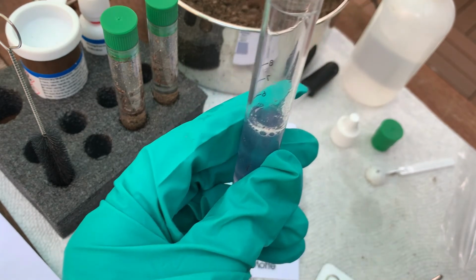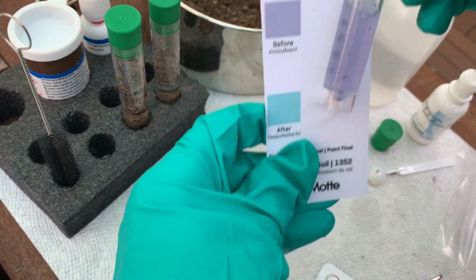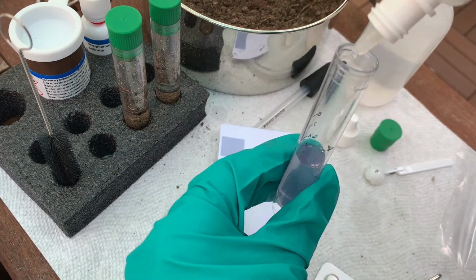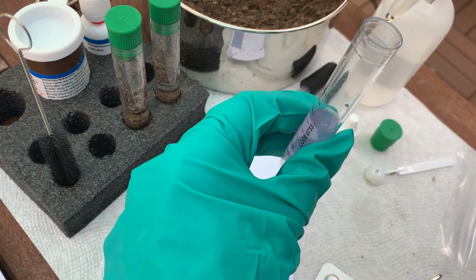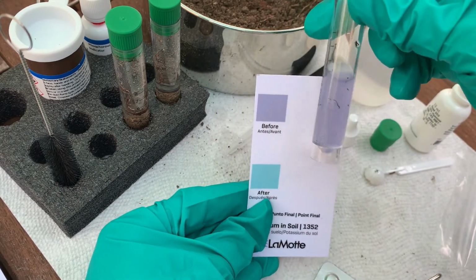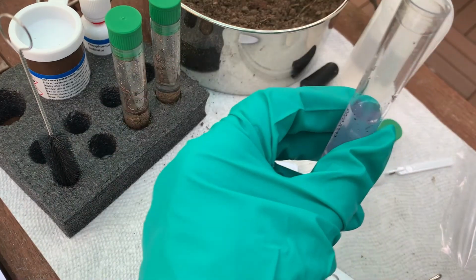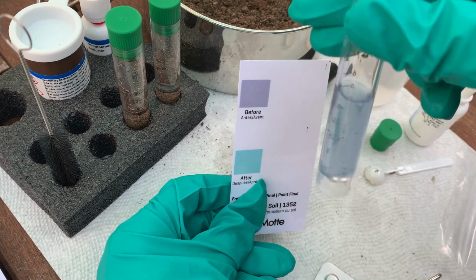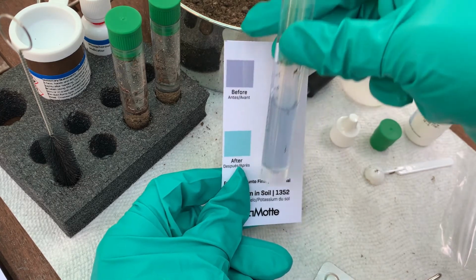The more drops we add, the lower our potassium level. And now we'll add drops 2 at a time so that we can see and wait for it to change colors. So here we're at 12 drops. It's still purple. 14 drops. And it's looking like it's beginning to change colors.